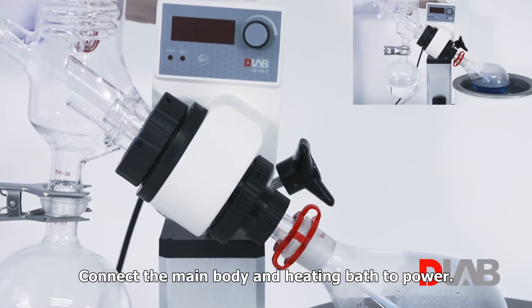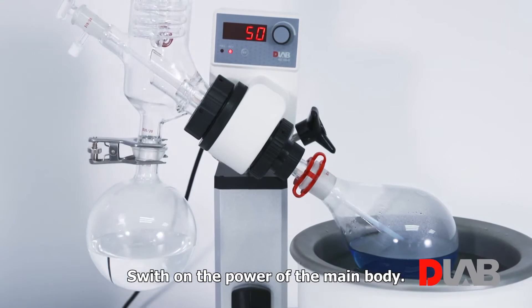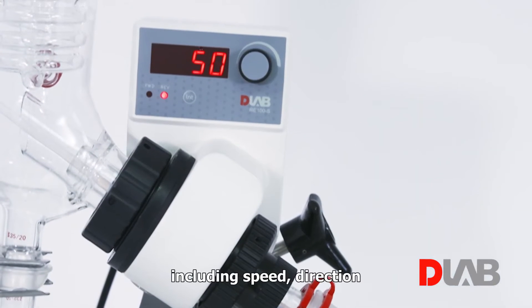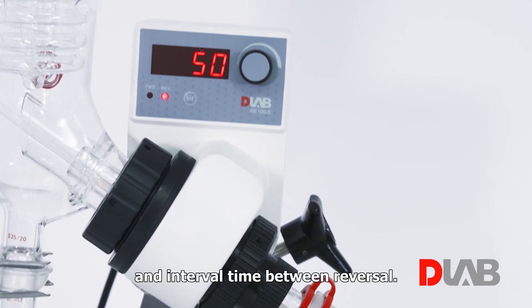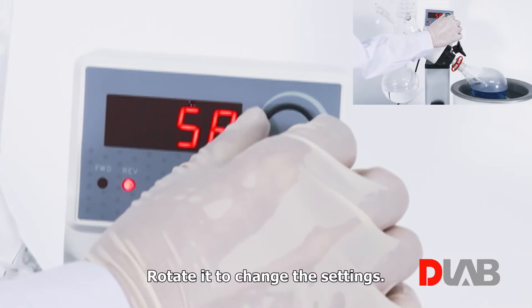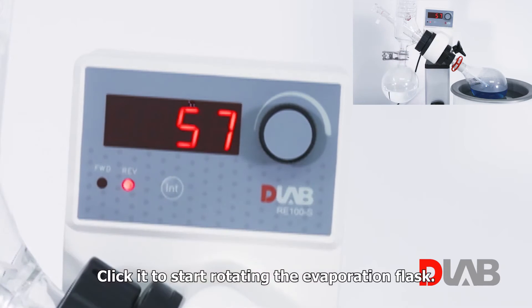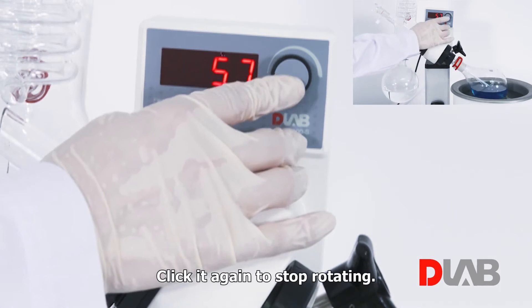Connect the main body and the heating bath to power. Switch on the power of the main body. The screen displays the latest settings, including speed, direction, and interval time between reversal. There is a knob on the right side of the operation panel — rotate it to change the settings. Click it to start rotating the evaporation flask, and click it again to stop rotating.